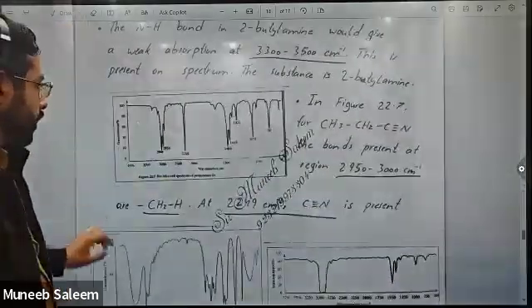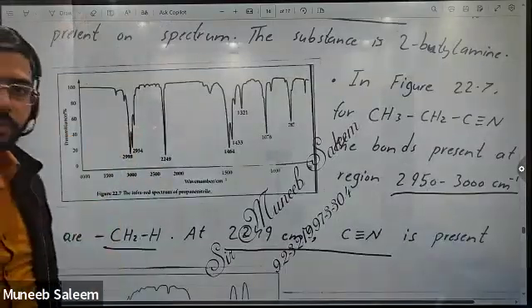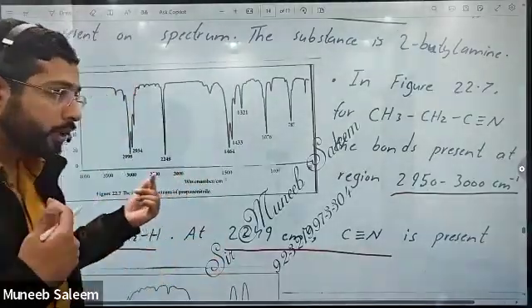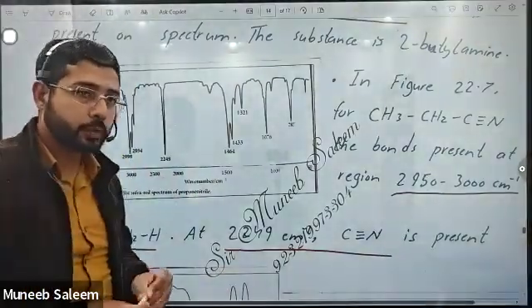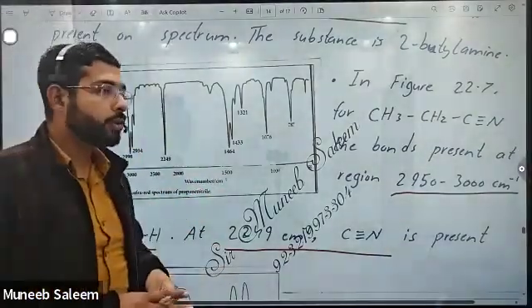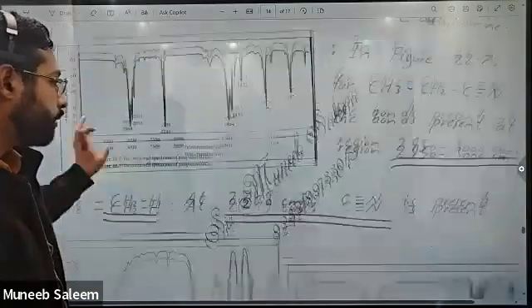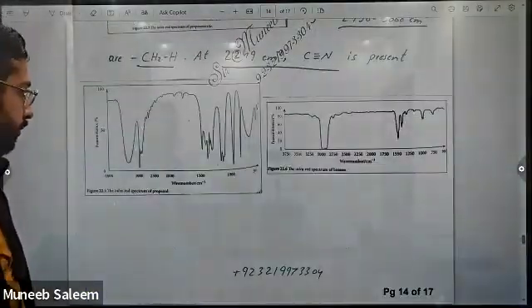So over here, 2249, very intense peak, but here you can see it is of the strong type. Why do we find a clash in the reported values in the table and actual shown on the spectrum? Again, the reason is that the molecules have different substances in the same mixture, and they have an effect on their structure. That's why we see some different structures.